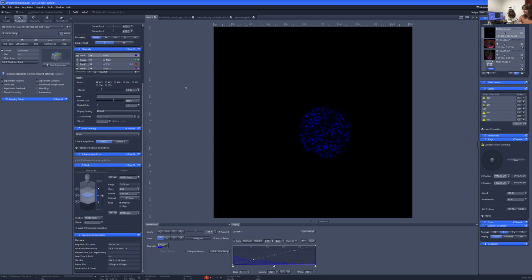So the first thing that I'm going to do, and actually Jess, if you would turn the computer really quickly, just to get one shot of what this microscope looks like. So this is the machine that I'm working with here, and it's really big, and it's a very, very powerful microscope. Oh, Mikala, would you mind pausing screen sharing, and then our faces can be big for the students? Good idea.